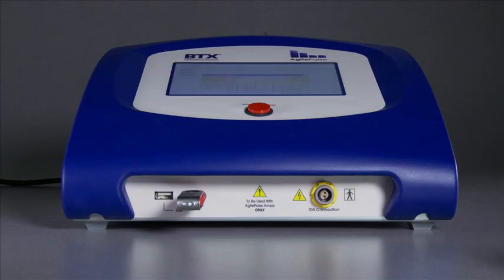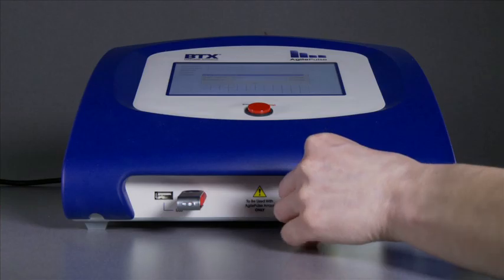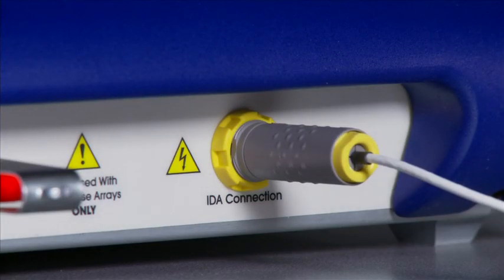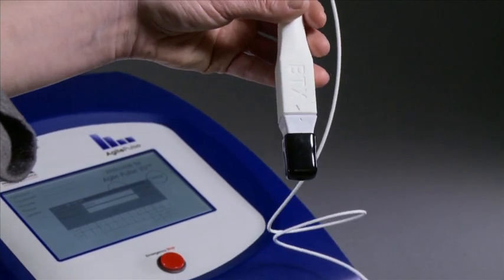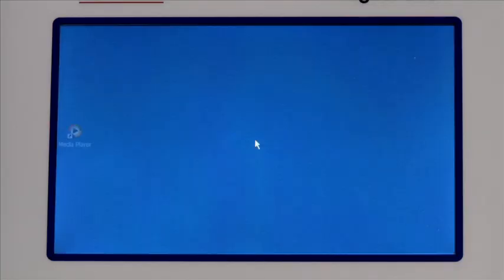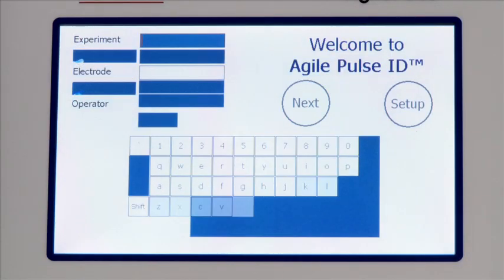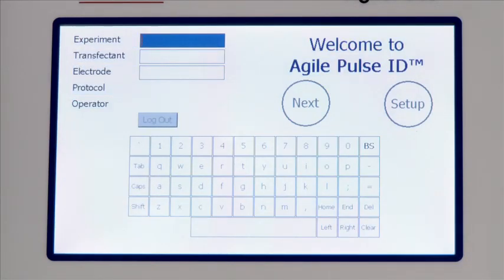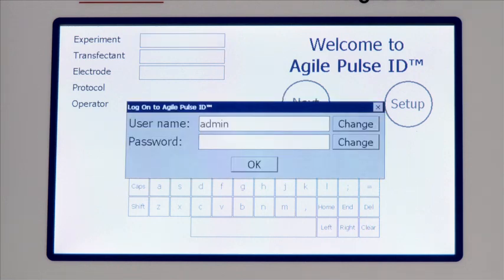Connect the electrode into the IDA connection port. Connect the electrode head into the handle, lining up the arrows. After power is turned on, a login screen is presented that requires the user to enter a username and password combination.